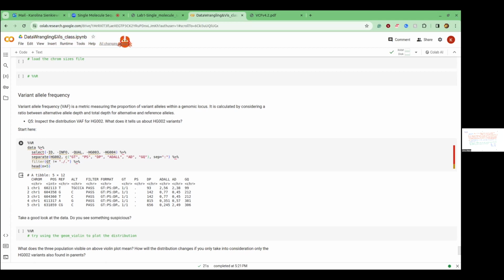Right, but do we keep all of those for the allelic depth column? So you would use AD, because if you look at DP, it has both of those, the sum plus the uninformative ones. So that's like a total, basically. Right, I guess what I was asking is if some of the reference calls are uninformative. It depends how you look at it, how much you trust your reference.